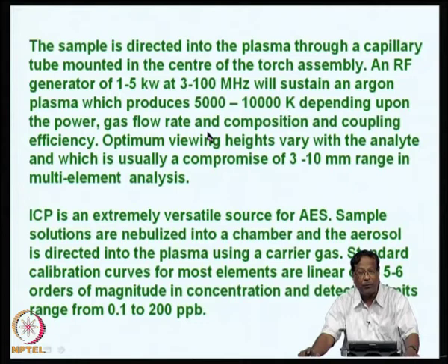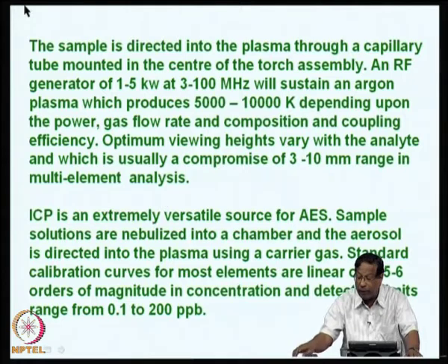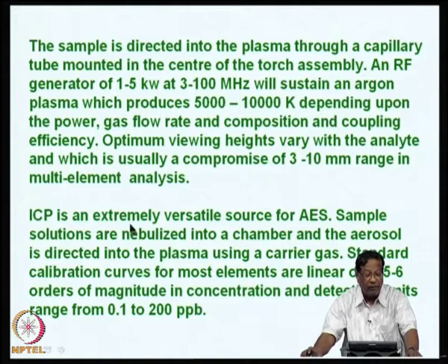That is optimum viewing height also in the plasma. I will show you presently a slide which will show you the different temperature zones. Now, what I want to tell you is ICP is an extremely versatile source for AES, atomic emission spectrometry. It can be used in the laboratory.